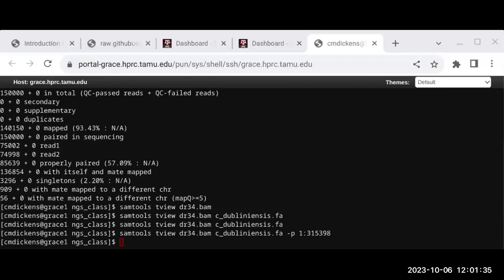So this will tell you the consequence of the amino acid change. If the amino acid change is detrimental, which means it's in a highly conserved region, it will let you know. Otherwise, it will give a different score and say it's common to have a sequence variant in this region, it might not be so critical, but this could help.